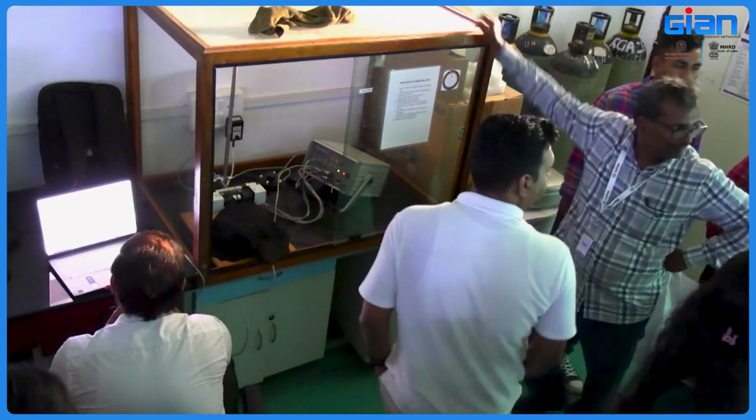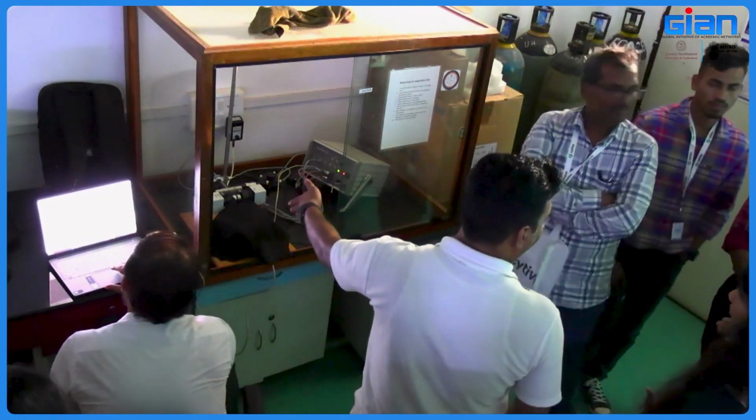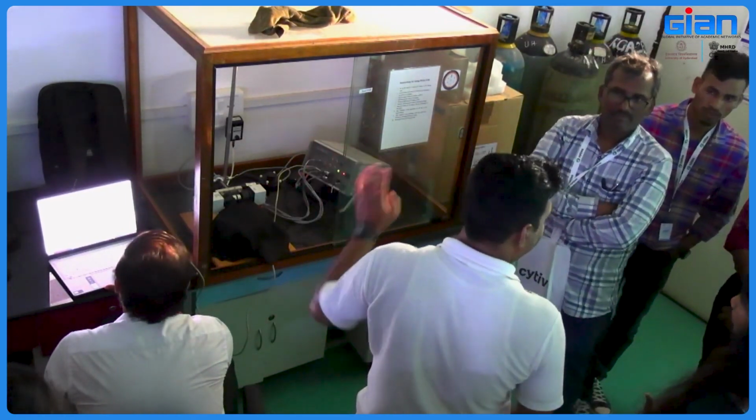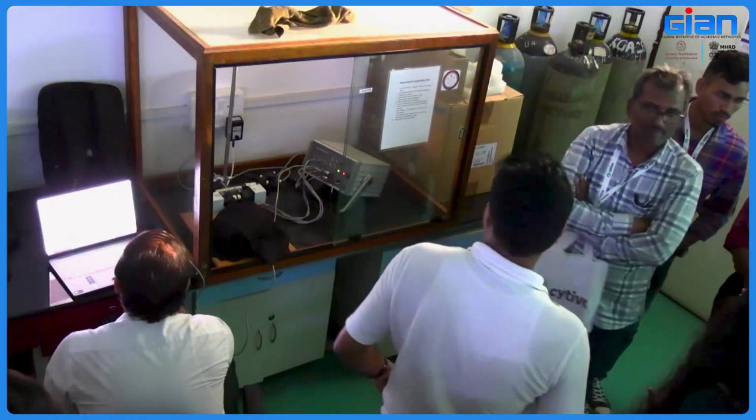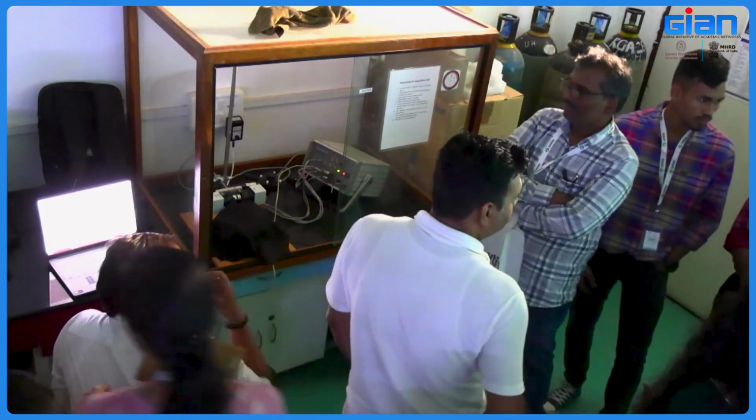Jyoti, can we take the technical replicates? You can take. These are all technical replicates only. The one I'm taking is all technical replicates. Three or four, how many? At a time you cannot take, one by one you have to do. So that's why I'm asking.